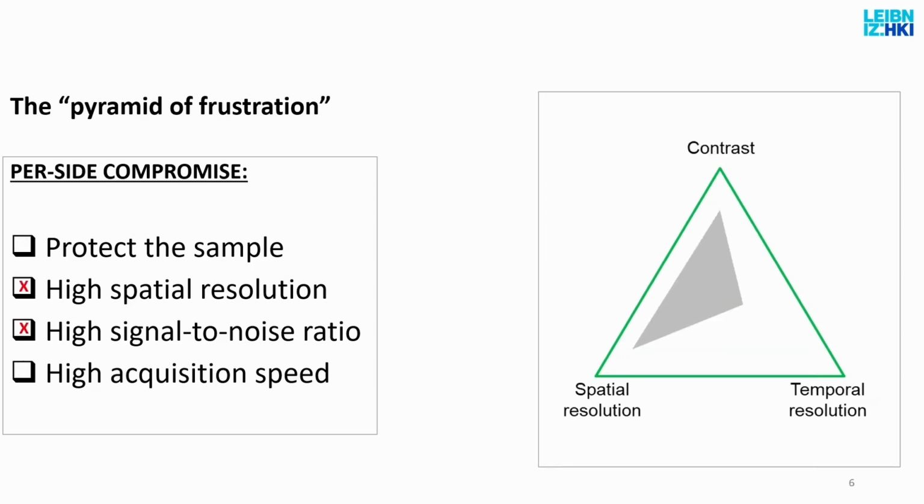Or it's the opposite. I have a labeled, stained sample, fixed, so I need to resolve molecular clusters. I need to resolve, for example, nanoparticles, bacteria inside macrophages. Then I need the resolution, and I need the signal to noise ratio because I want to count individual bacteria. In this case, I'm on a different plane in this pyramid.